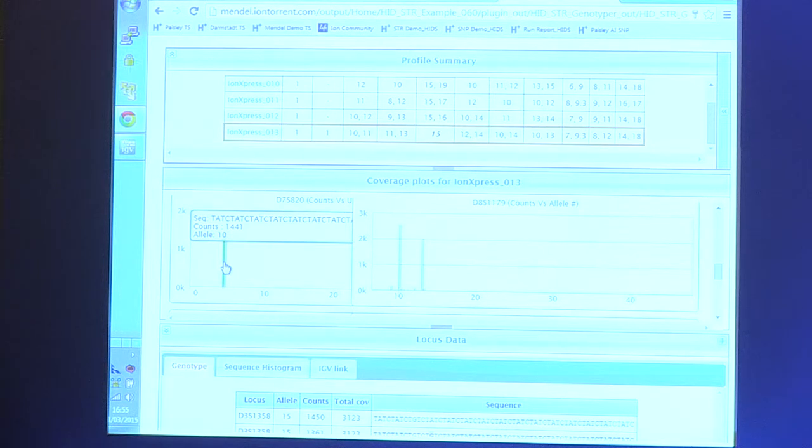In this case, there's only one type of sequence, but we've seen some examples throughout the day that what can appear to be just one allele in a CE-based view, when you're just looking at the number of repeats and that's all, if you actually look at the sequence in that allele, it can actually be more than one allele, and it could indicate that you had a heterozygote when you thought maybe it was only a homozygote, or it could tell you some information about a mixed sample that would make resolution easier than you could have with CE.